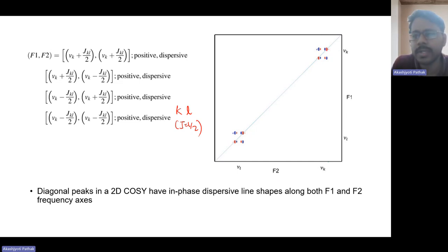So what is this? This is basically a contour map of the frequencies that you will observe. You have the spectrum, but you have cut it and you are observing it from the top at different layers.